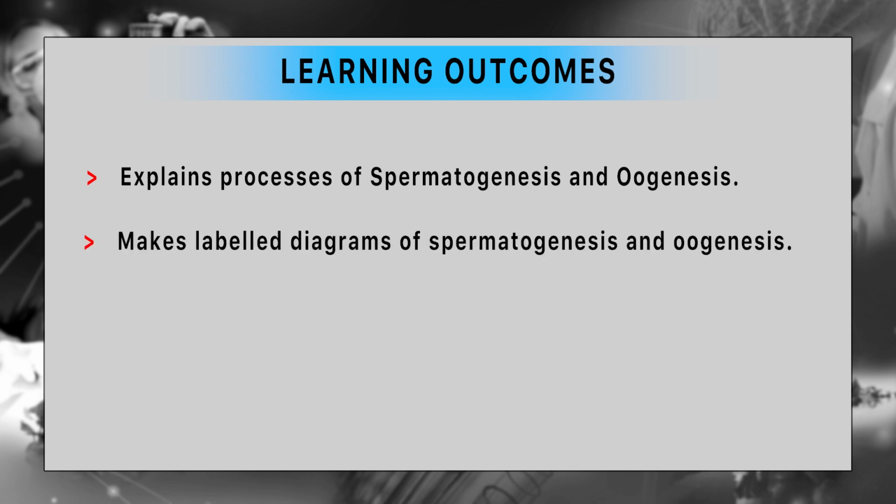Makes label diagram of spermatogenesis and oogenesis. Demonstrates skills for handling microscope by observing slides under it. Communicates the findings while sharing their observation. Communicates the findings and conclusion in standard scientific language. The results of the exercise are in standard scientific language that can be communicated to others.